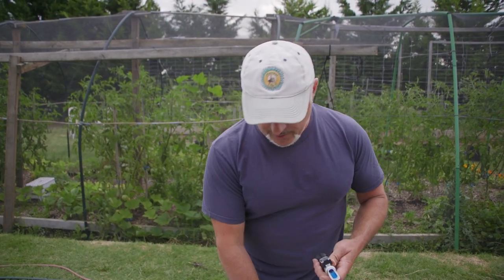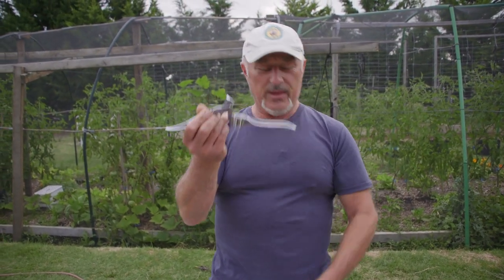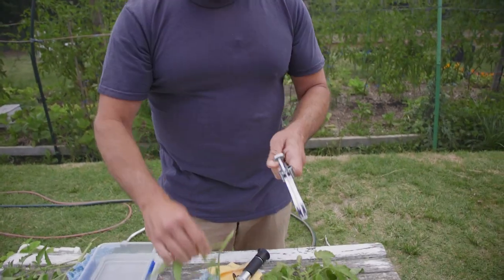What you need to do is get yourself a garlic crusher, like this here. And we add some leaves in there so we can extract the juice from it.